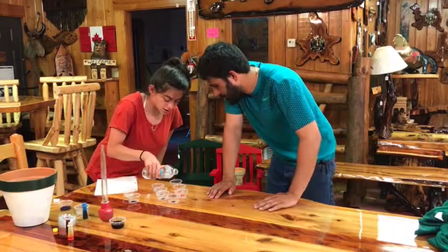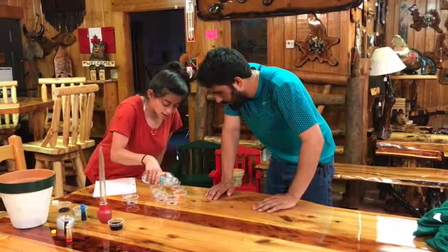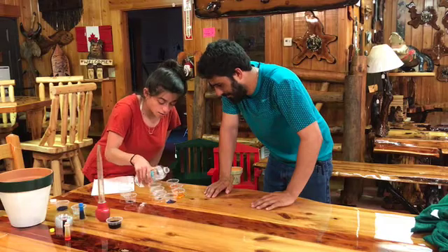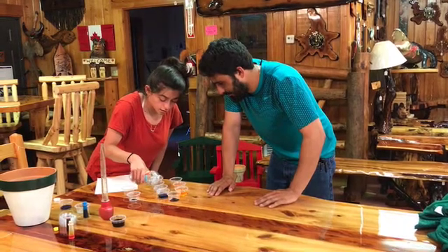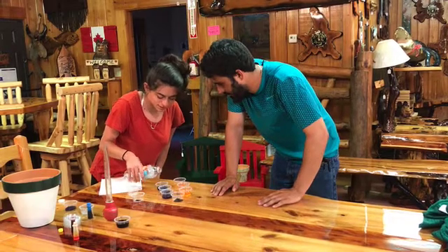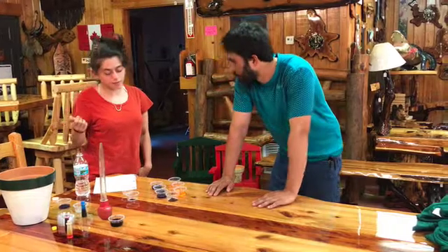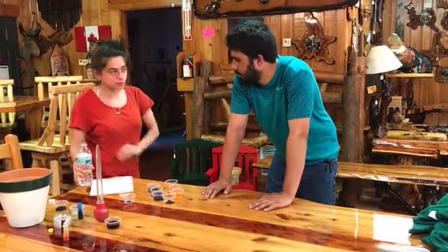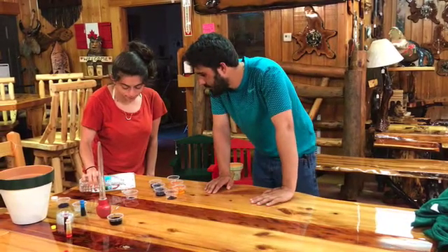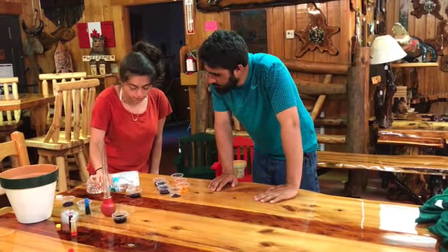Notice the immediate change in color as it gets less and less brown, and it starts to get more and more of a nice blue. Wow, look how nice this blue is. And so now we're going to add our 20 microliters of PBS to serve as the blank, and then 20 microliters of our protein of interest.